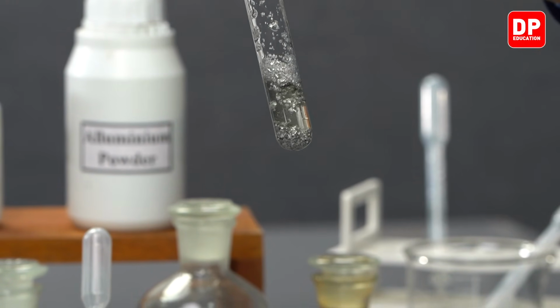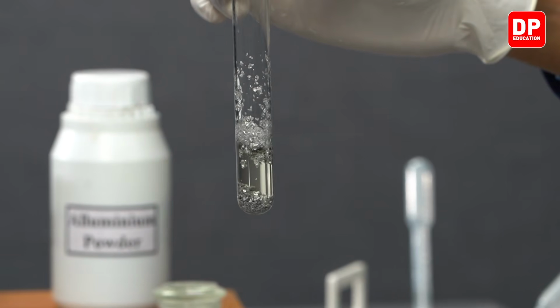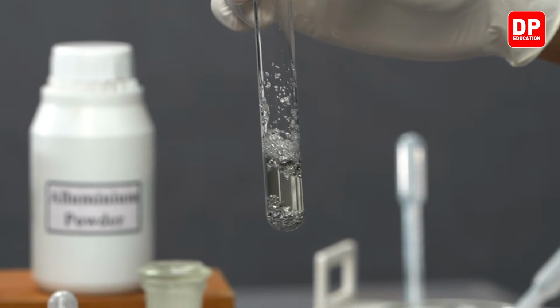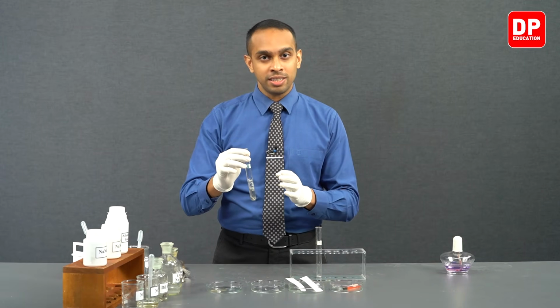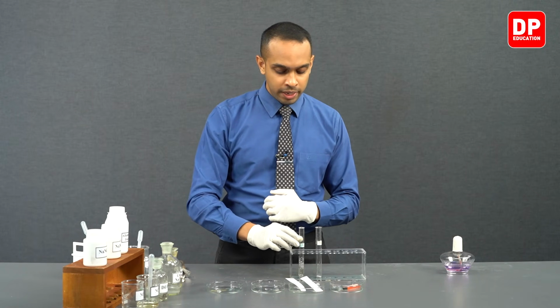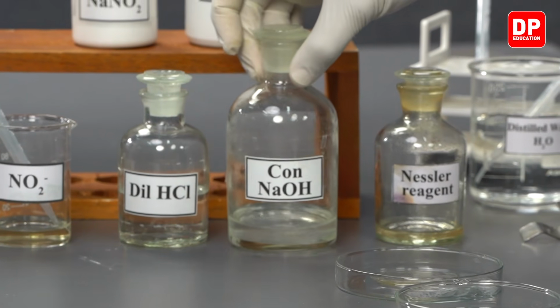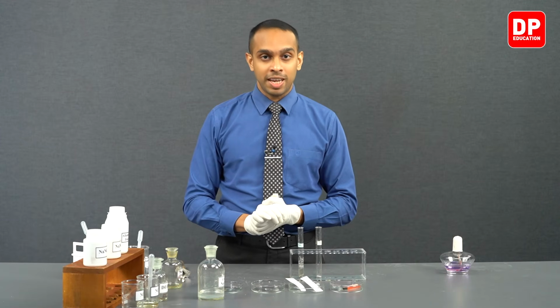Now, as you can see, this is a metal that doesn't react with a solution of nitrite ions. However, it will react with concentrated sodium hydroxide. Now, after adding our nitrite ion solution to aluminium, we will place it here, and we are going to be adding concentrated sodium hydroxide to this reaction mixture we have.